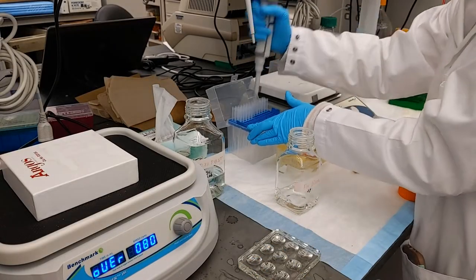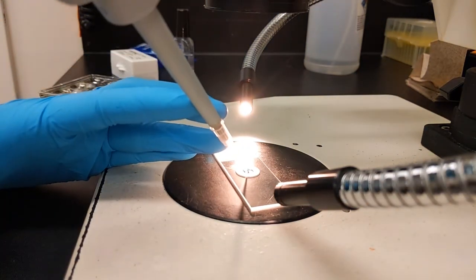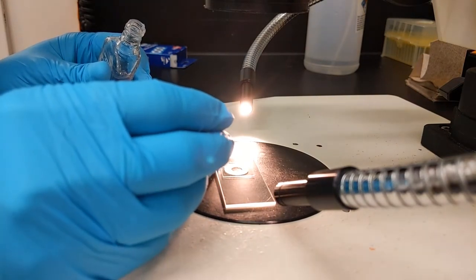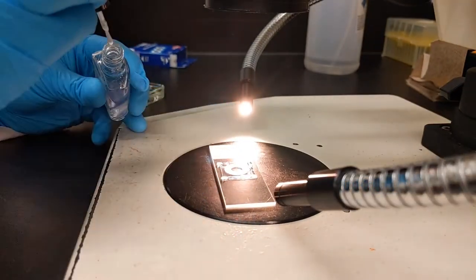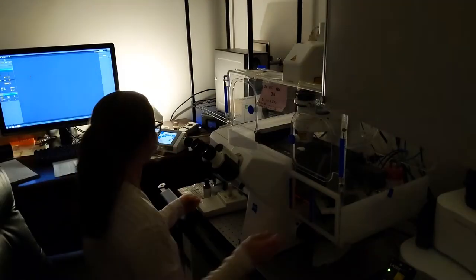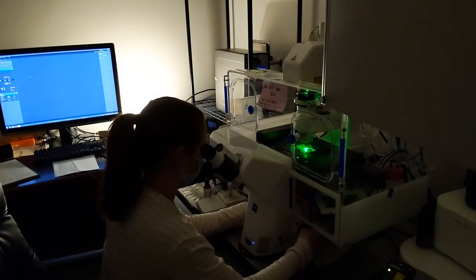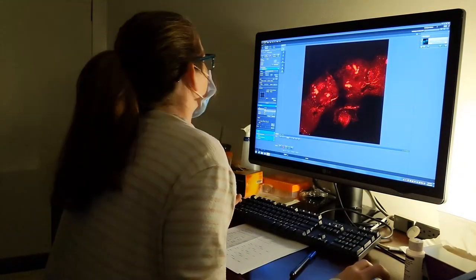After two hours in the second stain, we wash our samples one last time. Then we put them on the slides that work for imaging. I'm quite literally sealing this with nail polish, guys — real fancy here. Finally, the fun part. I'm using a confocal microscope, which is a fancy microscope that is worth more than my salary for the next 10 years. The great thing about this microscope is that it allows us to excite that green fluorescent protein and pick up exactly where it is down to the cellular level.